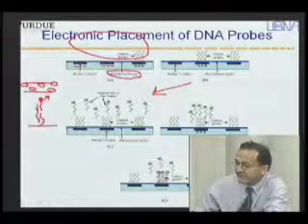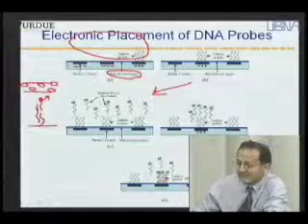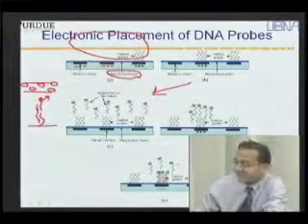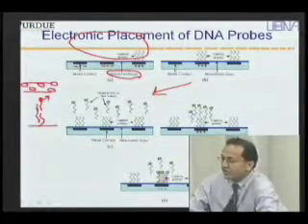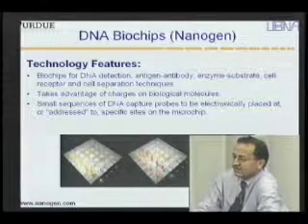Okay, so you can use a combination of this scheme, and this is all software controlled, and at the end of the day, you get this array, basically, which will have lights coming off from different sites, indicating the extent of the reaction at those sites. Okay, and this is shown here.